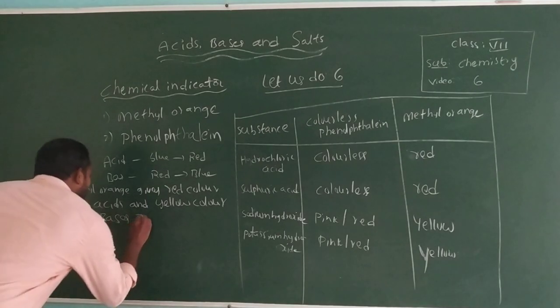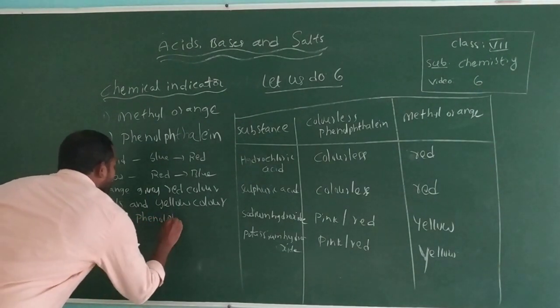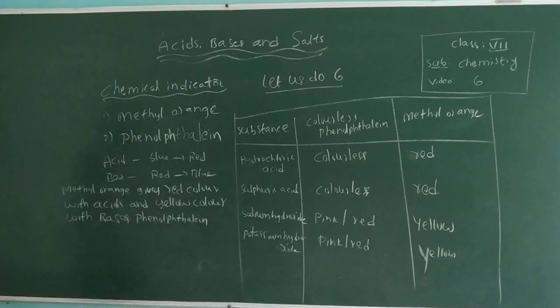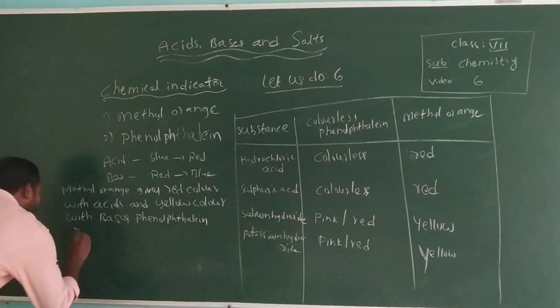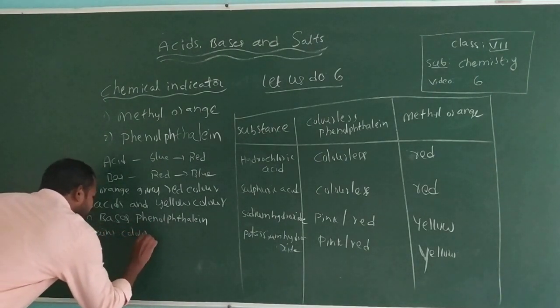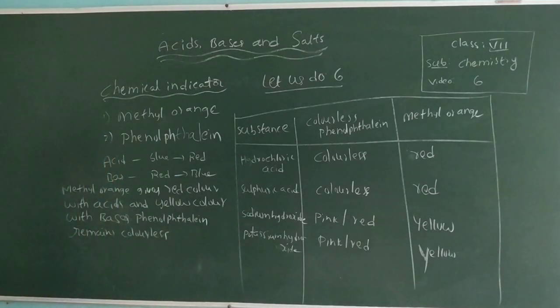Phenolphthalein remains colorless in acidic solution.